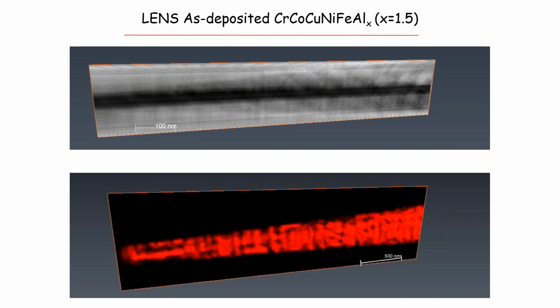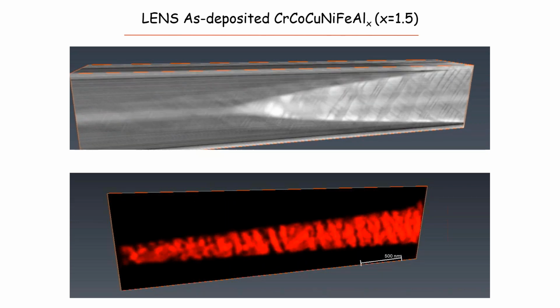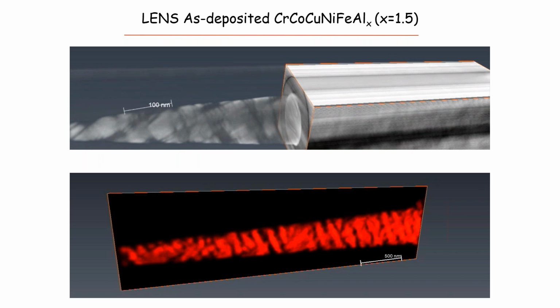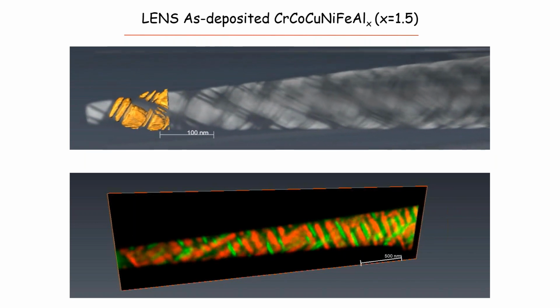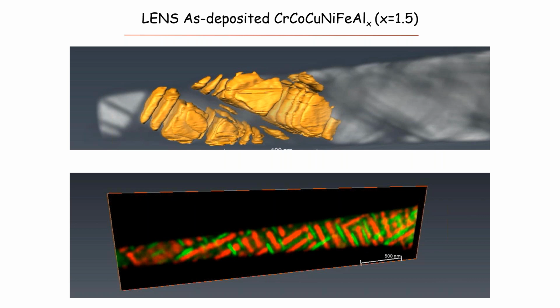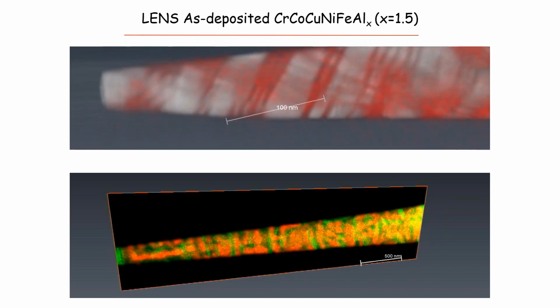Can you click on it? Yeah. So this is how the tomography was done. Avizo was used to segment those. On the top is just image segmentation. The bottom is the EDS tomography of the needle.